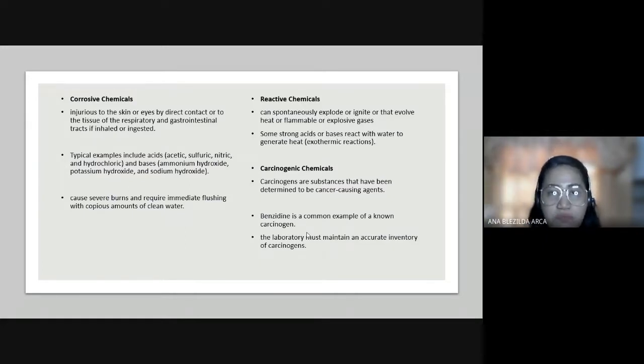It can actually cause burns. Di ba? Burning 'yan. So ano ba yung first aid kapag ikaw ay napatakan ng mga acid or base na 'yan? Totoo ba yung sinasabi nila na kapag daw napatakan ka ng acid, patakan mo ng base? Pwede ba yon? Ay, napatakan ako ng hydrochloric acid, kuha ako ng sodium hydroxide, punasan ko. Is it really true? Mali, class, kasi yung sodium hydroxide na yan, chemical din yan eh.